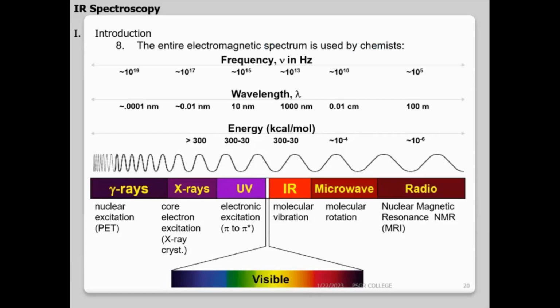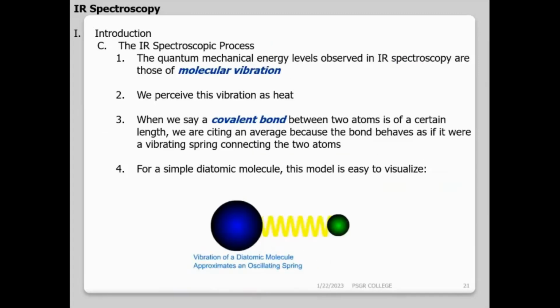I'm going to skip these, you would have studied them. I don't want to repeat things. In the electromagnetic spectrum, in UG, you studied how different radiations behave differently. Generally, when I see IR spectroscopy quantum mechanically, they are all molecular vibrations.